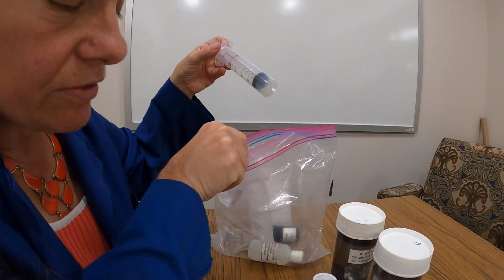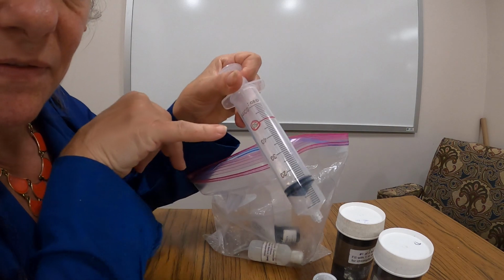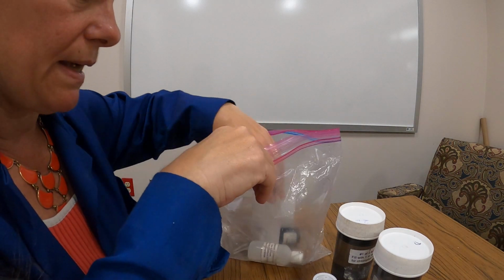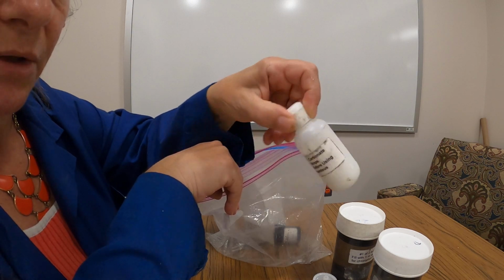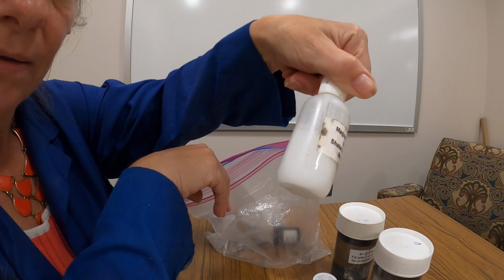In your chlorophyll kit, you'll also have a syringe, and that's marked at 50 ml. That's to remind us that that is the usual volume we'll be filtering. You'll have a bottle with magnesium carbonate. This stuff settles out really quickly, so when you use it, you need to give it a nice little shake just to make sure that it's kind of milky looking.